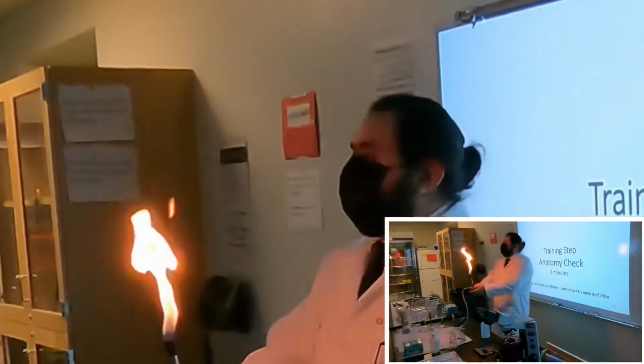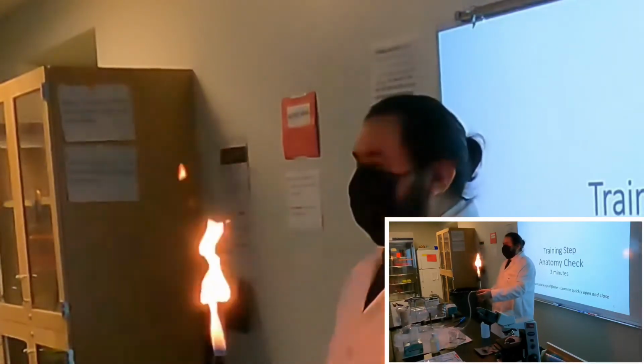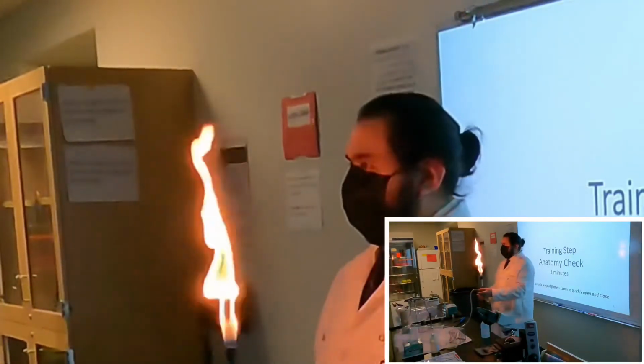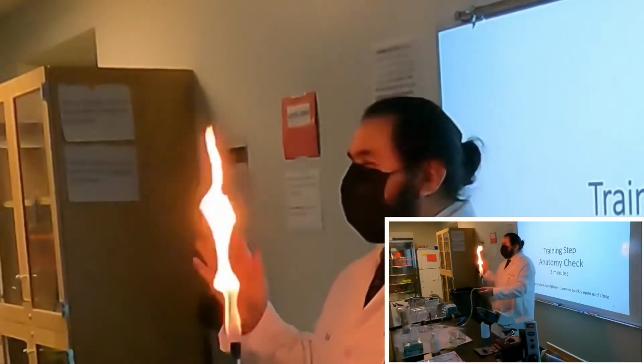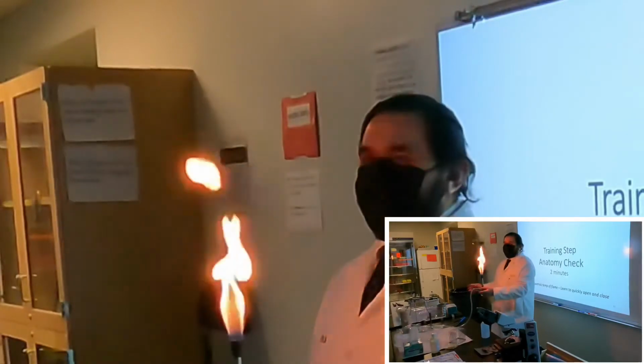I know what you're going to say. What I'm going to do is not something that anybody should practice in general. This is not a flame we use in microbiology because it doesn't burn. Yes, it does burn. There's enough moisture in our hands and things like that, but it doesn't do anything. So please don't do this.